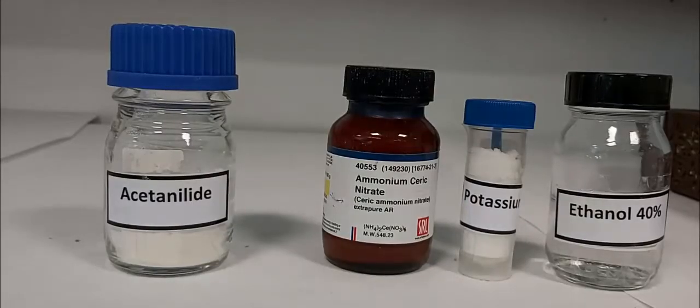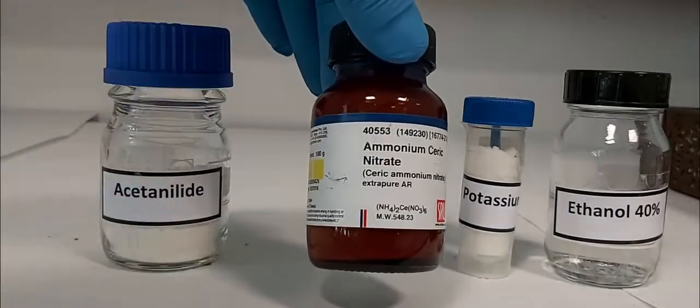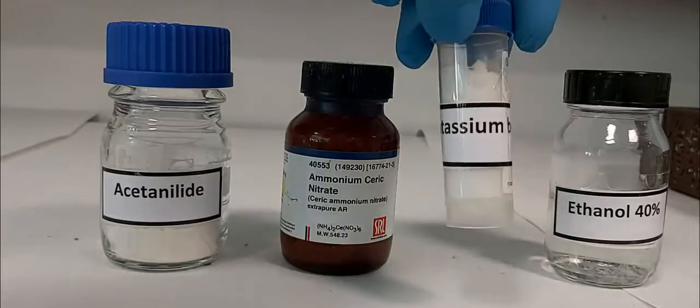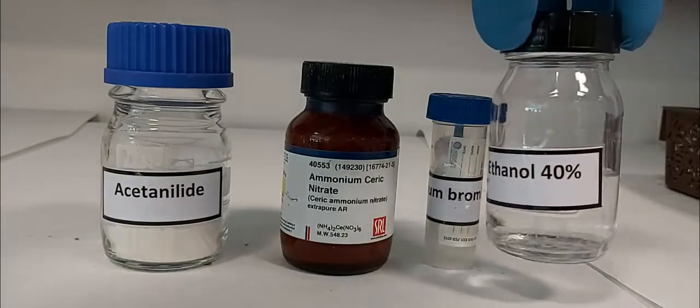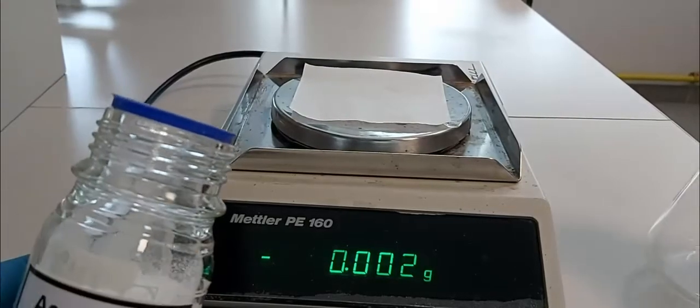For this reaction we need acetanilide, ammonium ceric nitrate, potassium bromide, and ethanol as a solvent. First of all, we weigh one gram of acetanilide.